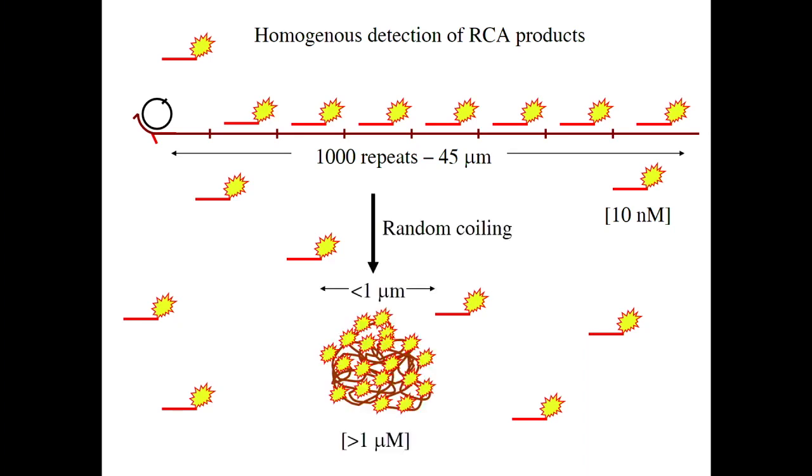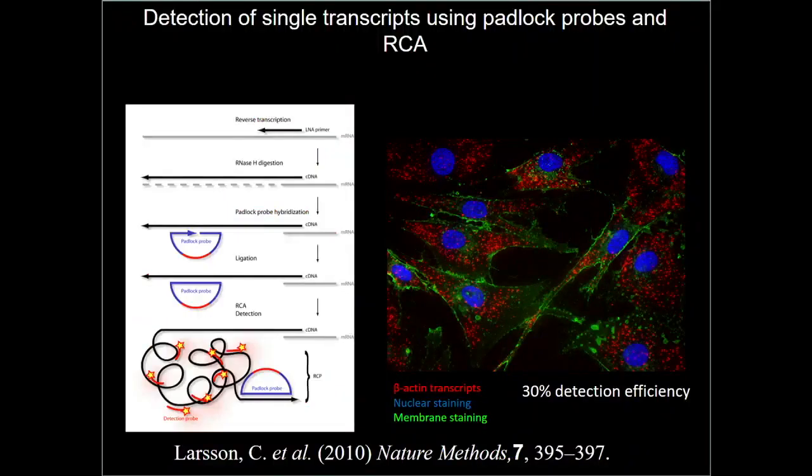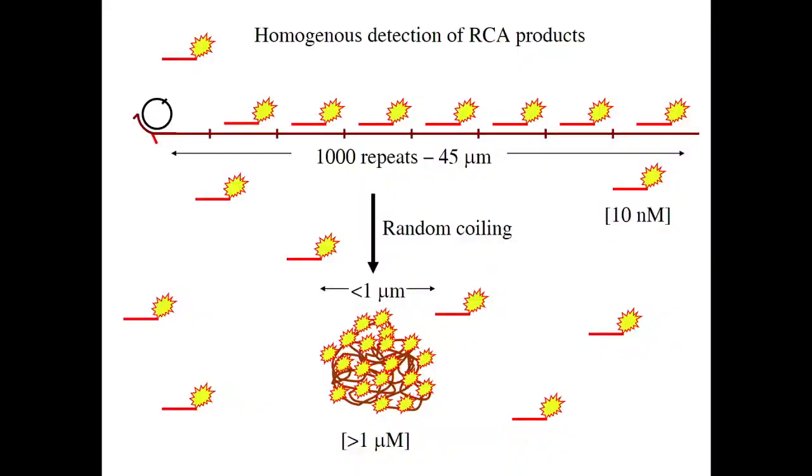This will, in the water solution where they are created, coil up spontaneously into submicron-sized blobs of DNA just because of random collision with water molecules. And then it just has to collapse into one spot. It's not a small spot, it's quite a big one. It's a couple of 100 nanometers in diameter. So it's a big molecule. And it's bright. We can easily visualize it by hybridizing short oligonucleotide probes to this tandem repeated DNA molecule.